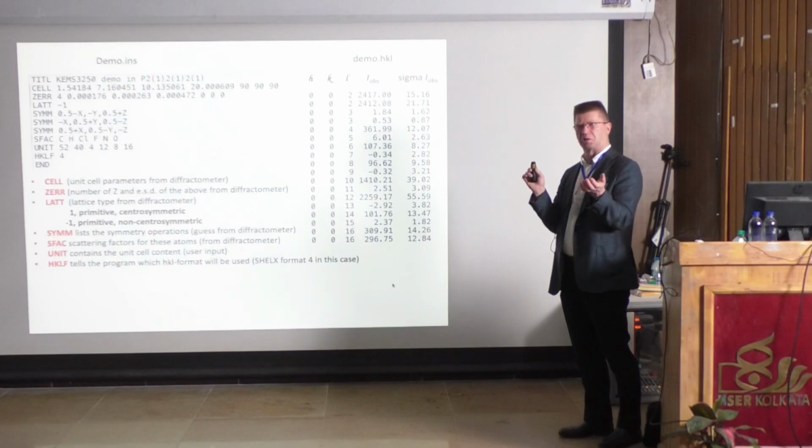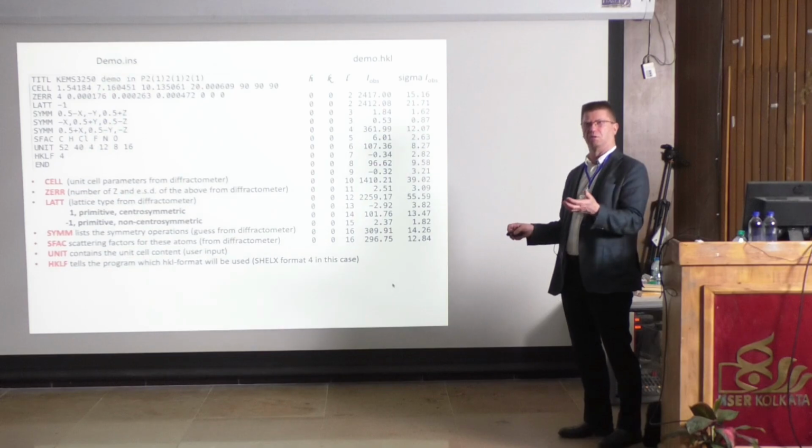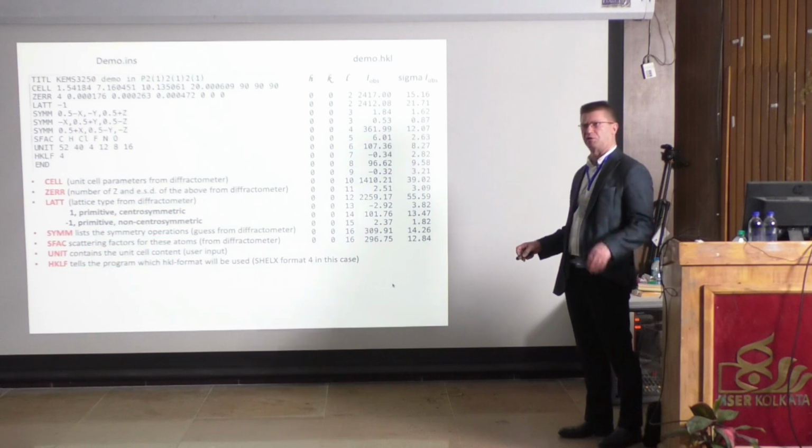And now the symmetry operations, what are here, these are coming from the symmetry operations inside the unit cell. So it analyzes the data and sees, okay, it seems to be that these kind of symmetries are there based on the diffraction.